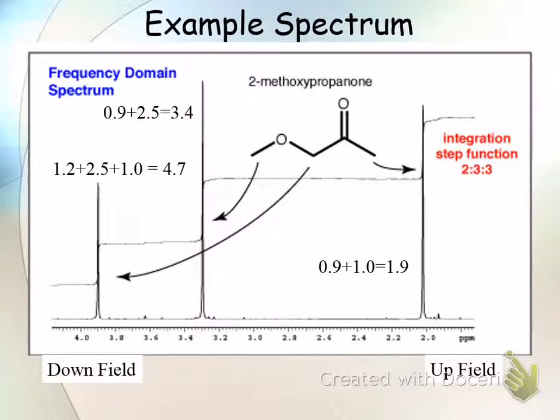Well, just because it's high, the intensity is higher. Oh, yeah. So how many hydrogens are here? Well, that one's 2. And this one is? That one's 3. But then on the other one, it's 3, but it's lower. Yeah, but the amplitude is misleading.